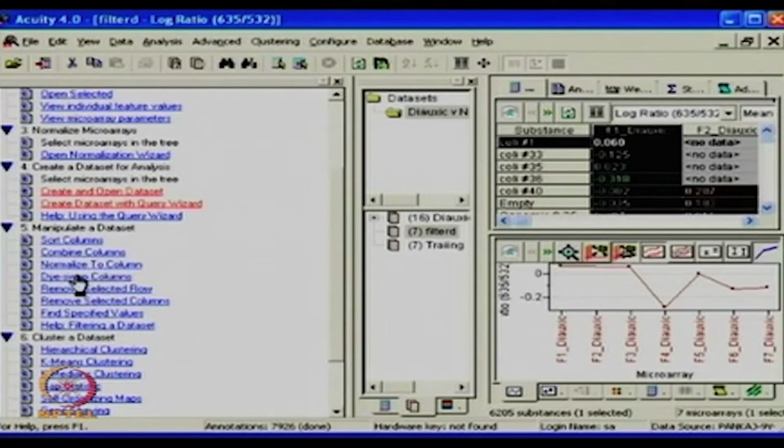So many times you can also go for a normalized to column. The meaning is I am having a 0 to maximum, so I want all my data to get normalized to the first column. This feature is used when you are essentially using a time point. So all will be standardized or normalized to one column which you have defined as 0 at 1.